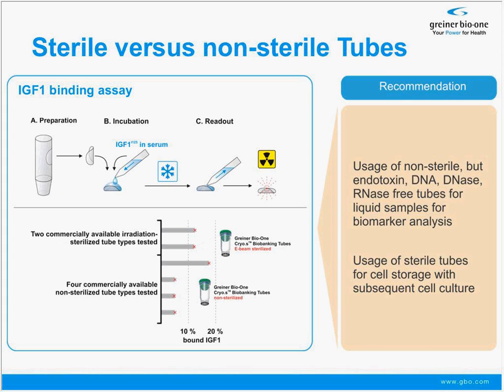On the other day, the frozen sample was thawed, the lid was removed without any remaining rest, and the material sample was then put in contact with scintillation liquid, and it was assessed if residual radioactivity was present. In this assay, we had a standard curve so that we could recalculate from certain counts per minute radioactivity how much IGF-1 from the original serum was actually captured on the surface.